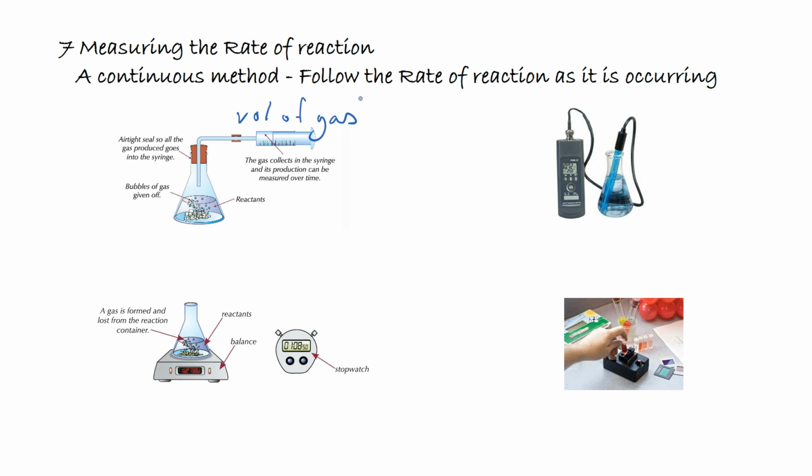We can also measure how the mass of a reaction changes. So perhaps we've got a solid in our beaker and the mass decreases as the reaction occurs.